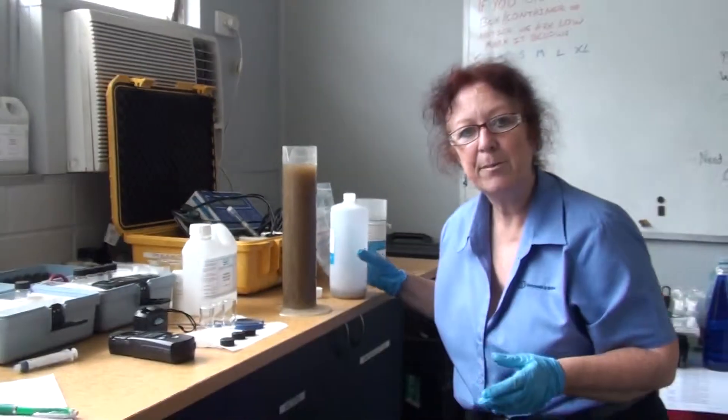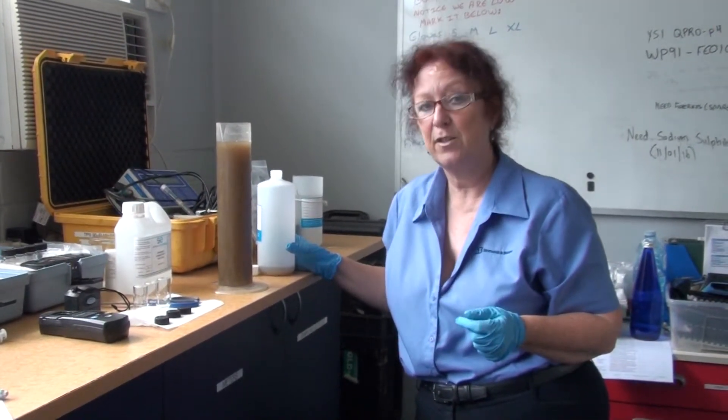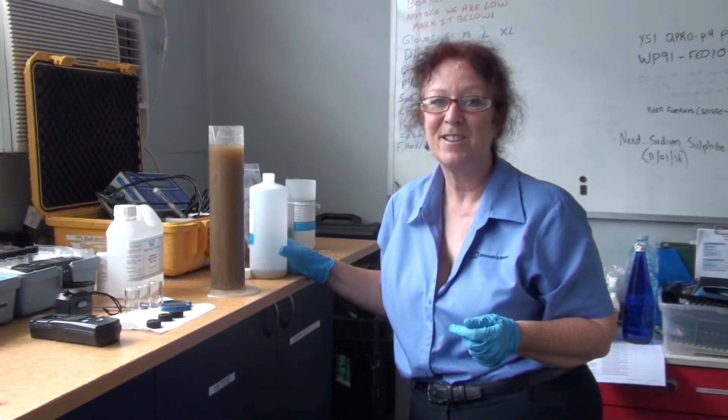And there we go. Now I'm going to start my timer for 30 minutes. Sometimes you might like to do a 5-minute settlability and a 30-minute settlability just to give you an idea if your floc is really dropping fast or not. Thanks.